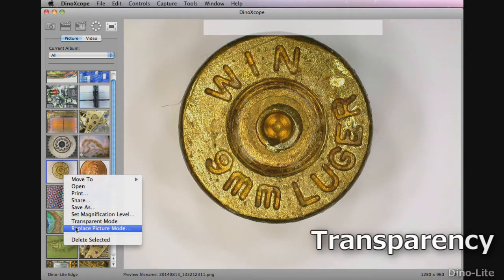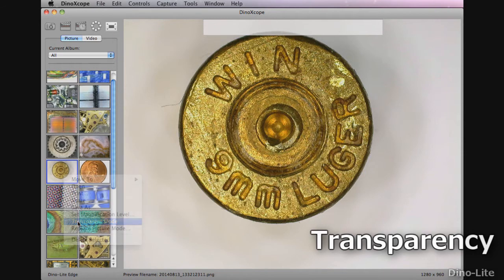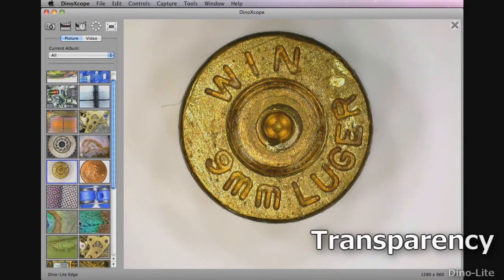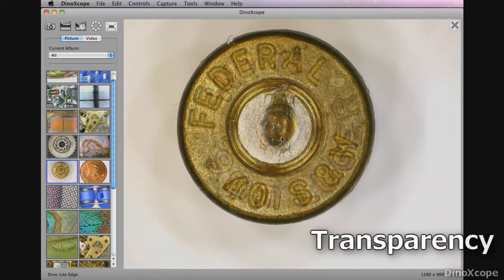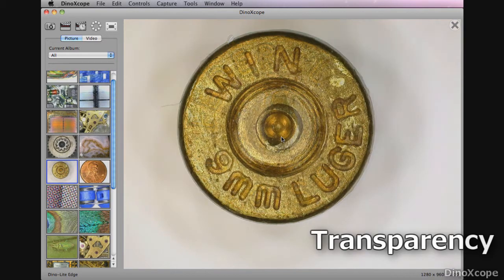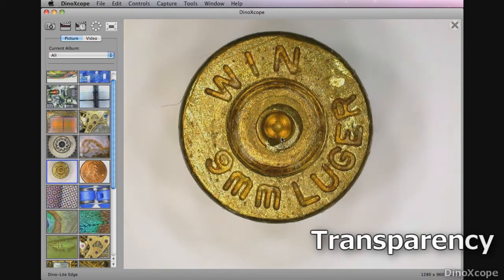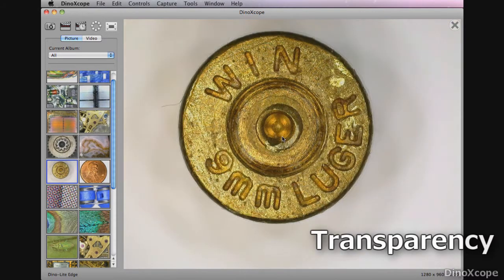Perform easy comparisons of a captured image overlaid on a live view of a connected DynoLite microscope. Right click on an image and select transparent mode. Adjust the opacity using the scroll wheel of your mouse, scrolling the trackpad on the laptop, or using the shift key and up and down keys on the keyboard.